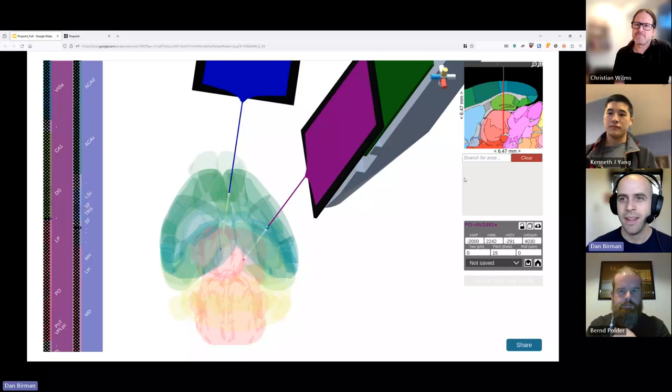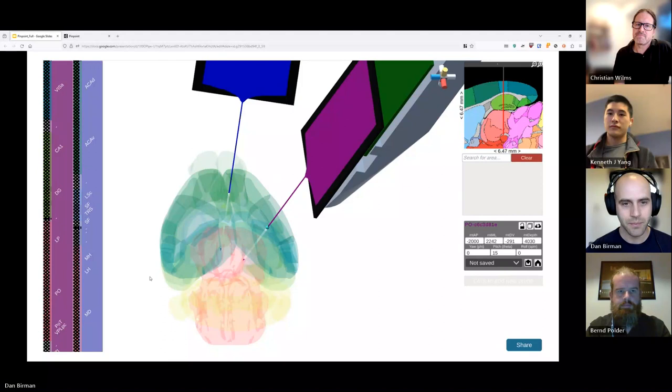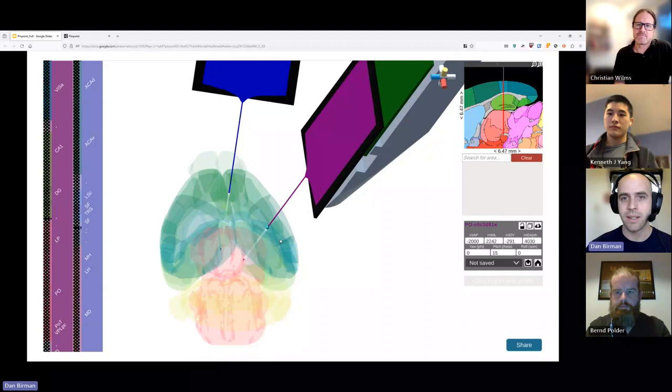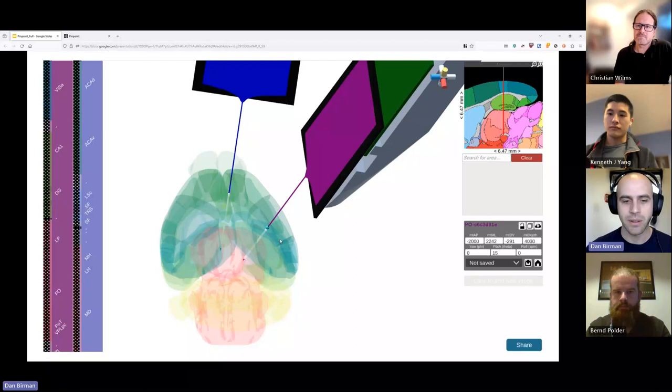Our tool is 3D first. The mouse brain here is shown in 3D meshes, and we have the ability for you to search for different areas, highlight them, and move the brain around in 3D space. It's nice in 3D because it's more intuitive than just looking at the 2D slices you might be used to if you've used the Paxinos Atlas or another printed atlas for planning.